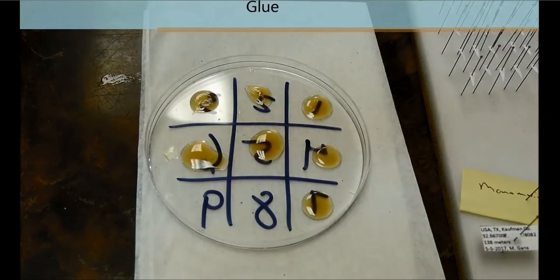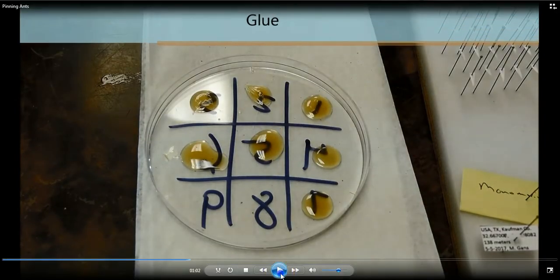You're going to need some glue. In our lab we use a type of glue called hide glue. You can see I'm using a lid of a petri dish, and I've divided it into quadrants so I know which one is the newest. The glue will dry out as you work, so you just add another little blob of glue. This lets you use this petri dish lid nine times. I've also prepared some points over here so they're ready to go.